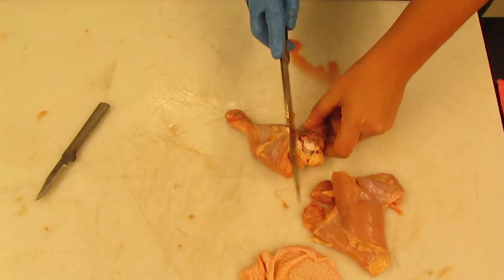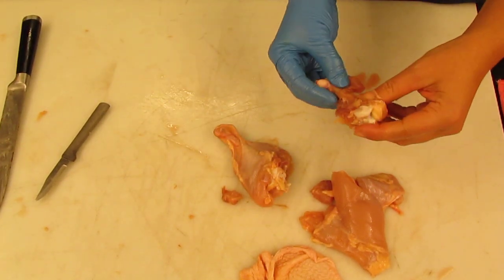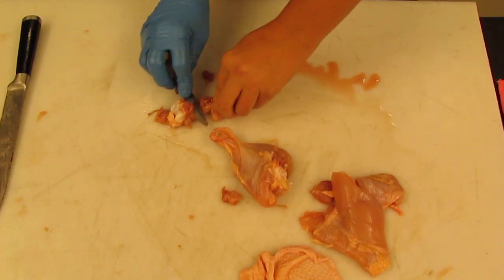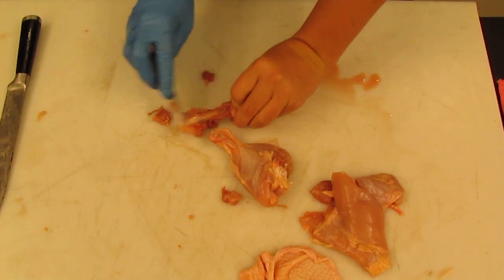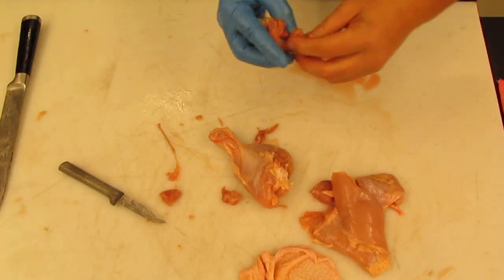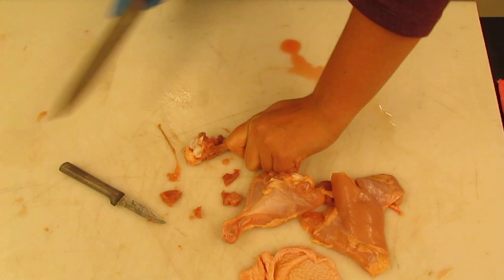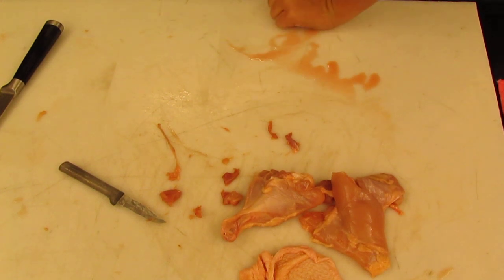Now, there's one more thing, and this is probably the least fun of the whole mess. So this is the femur. I have just detached the femur. I want to get the last bit of muscle off of the femur because the goal here is to break the bone and take a look at the spongy bone versus compact bone versus bone marrow inside. Of course, the femur is the longest, strongest bone of the body. It's a little bit difficult to break, so I'm going to try to make a little notch in it so it is easier to break.